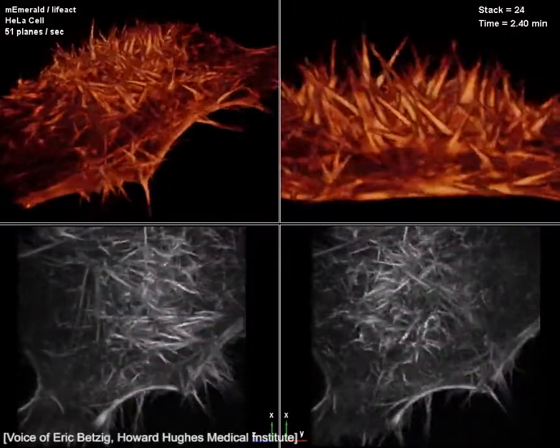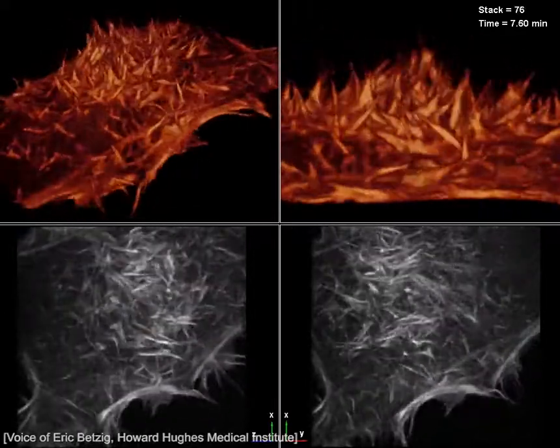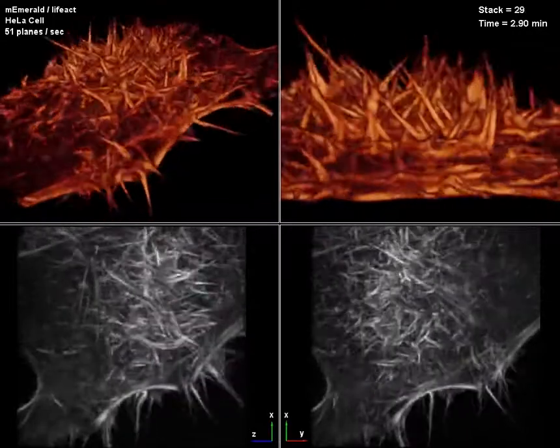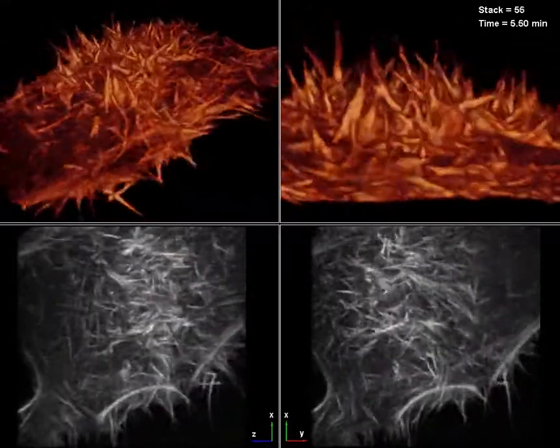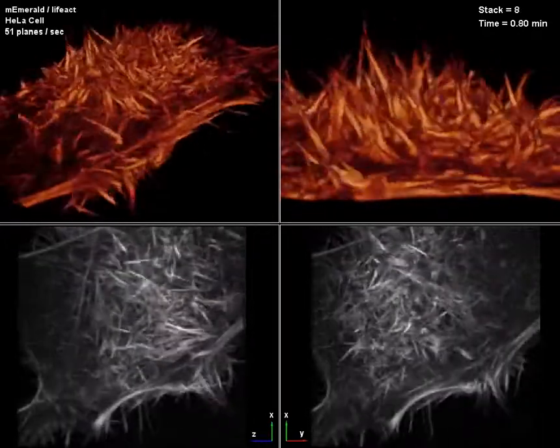This cell is a human cervical cancer cell, a HeLa cell from Henrietta Lacks, if you've read that book. It's showing the cell on a cover slip, but particularly on this dorsal surface, you see all these waving philipodia.